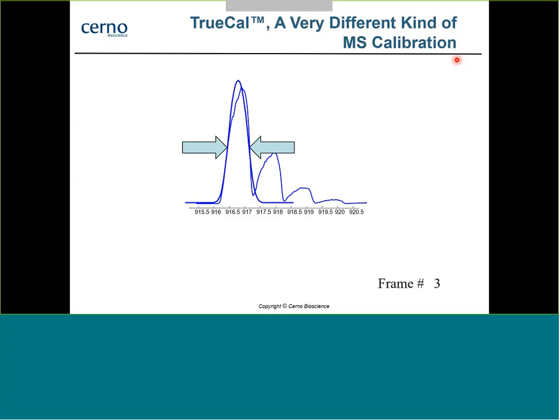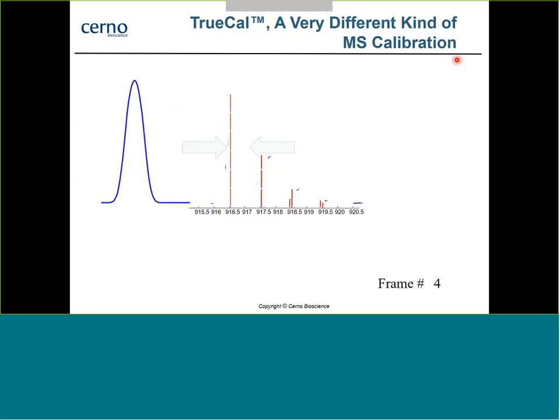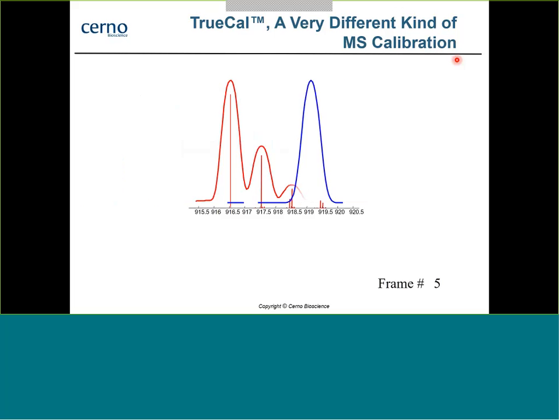And what we're going to do now is generate the true mass spec at infinite resolution. So those are all the isotope lines at infinite resolution of a true mass spec. In other words, we can pick out the exact masses, and we know the isotope distribution. So we've calculated the mass spectrum, and we can simply convolve our chosen line shape with that to come up with a true mass spectrum, okay, which has a known line shape, a perfect line shape.